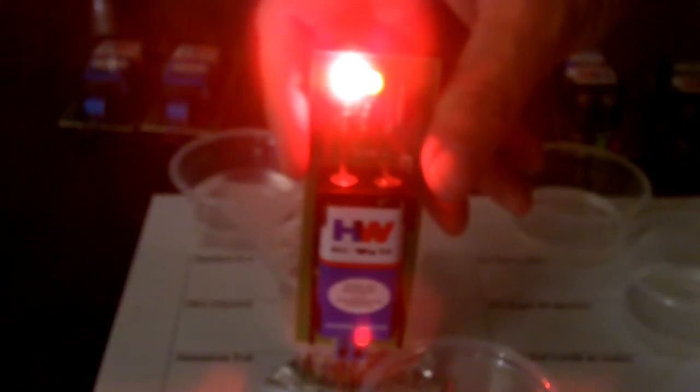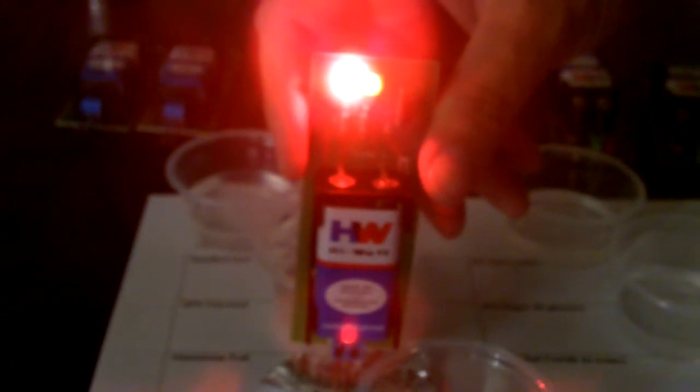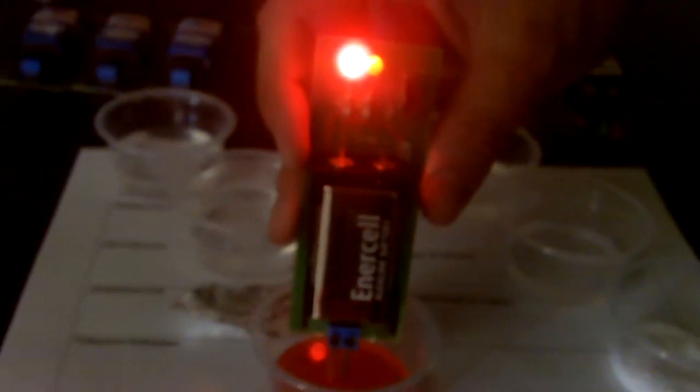Notice there the difference between the previous 2 brightness levels and this one here. And also think about the type of bond that we're talking about when we have aluminum foil versus the other 2, and how that might affect that. Now our unknown sample. You can do these in any order, it doesn't really matter.